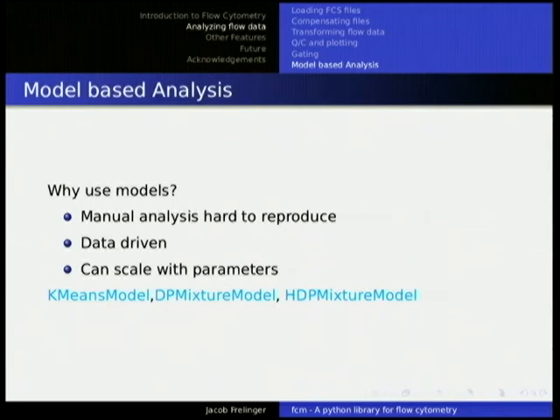Manual gating-based analysis. Oh, wow, all right. Got to speed things up because this is the interesting part. Model-based analysis. Traditional gating-based flow doesn't scale well. The more parameters means you've got to figure out what plots you're going to look at, how to find your populations. Doesn't scale well, near impossible to reproduce. Takes lots of training to get things close. Doesn't work.